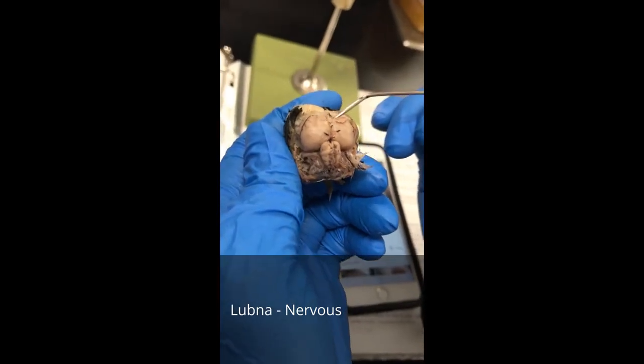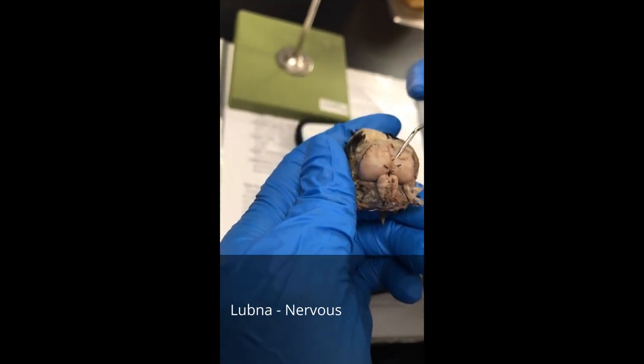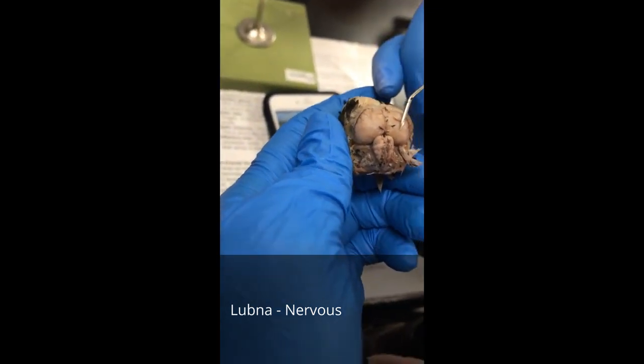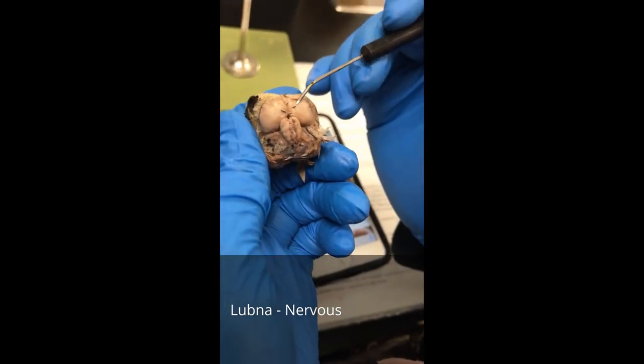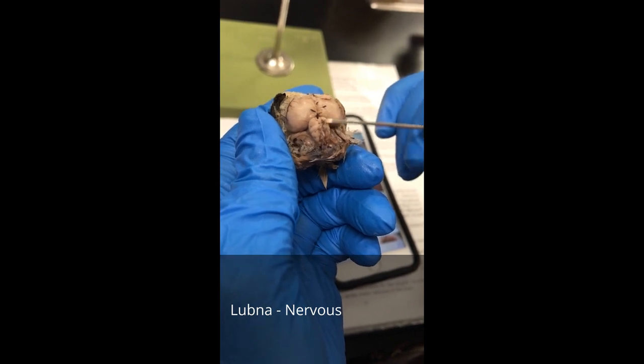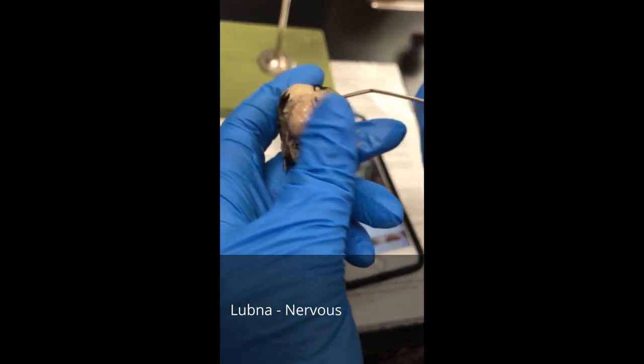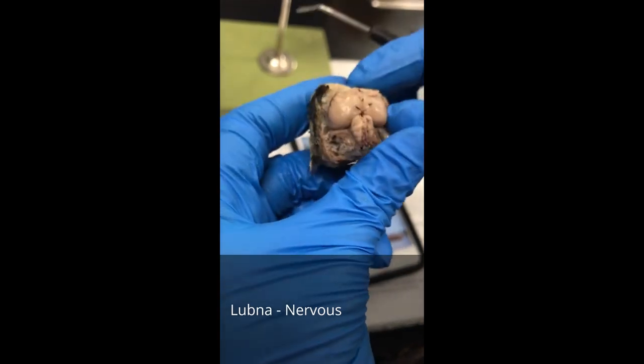These two right here are the cerebral hemispheres, and they're responsible for touch, hearing, smell, and memory abilities. And here is the cerebellum, and this is for skeletal muscle balance and equilibrium. And then the rest we couldn't show you because we couldn't get to it.